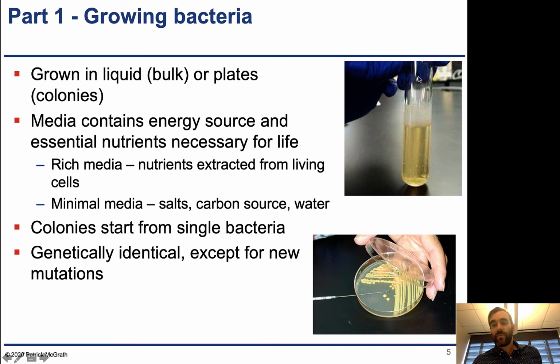So this is an example of a test tube. This test tube contains liquid media, and within this liquid media are individual bacteria cells. So probably billions of bacteria cells are actually within this particular tube. The other way we grow bacteria is on solid culture.